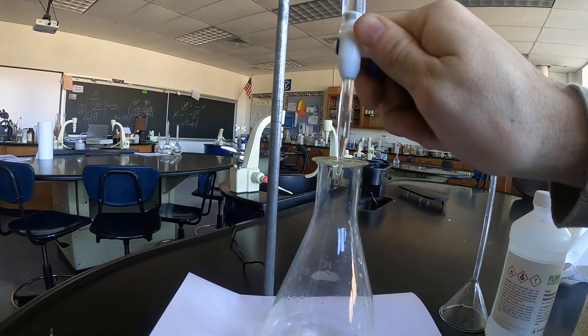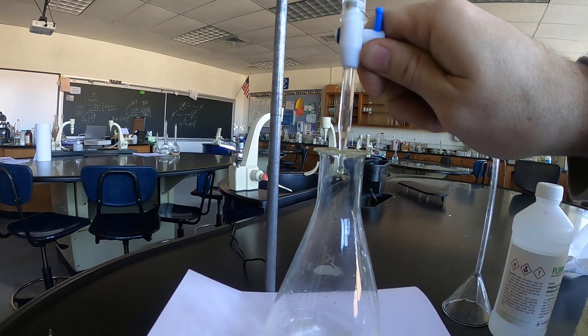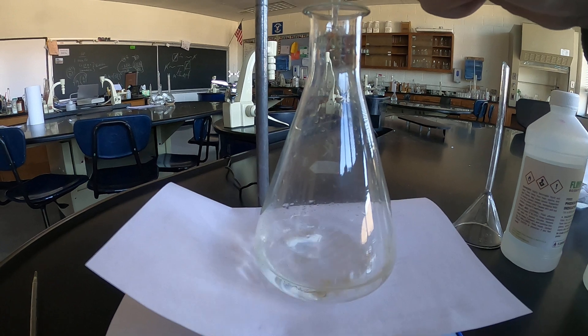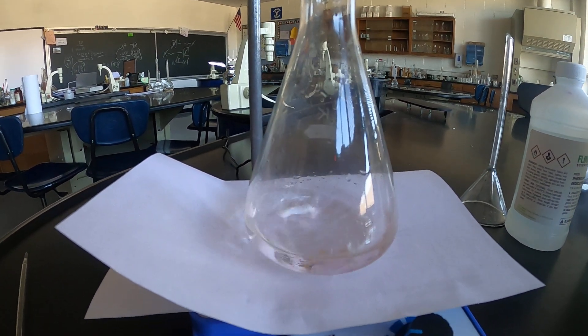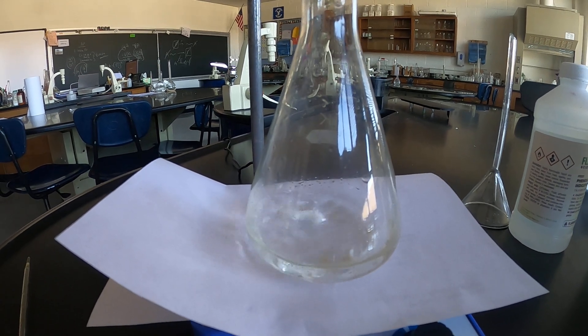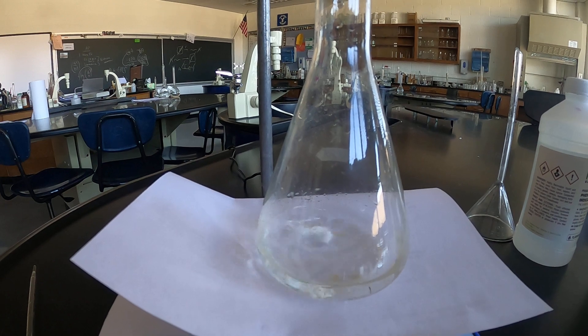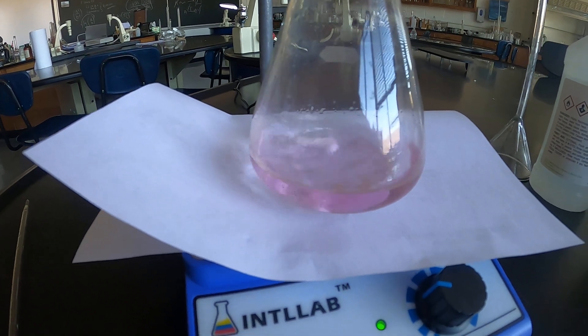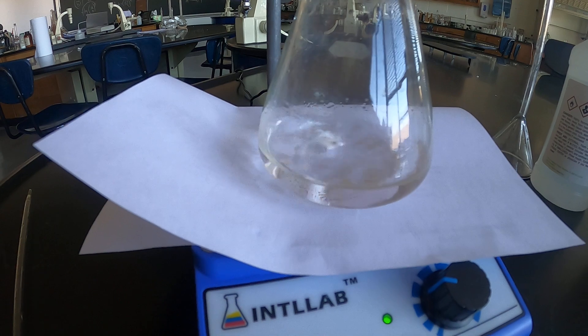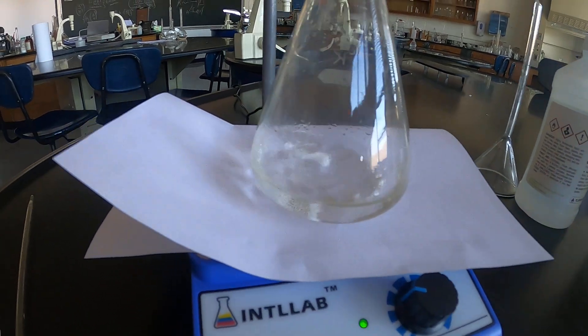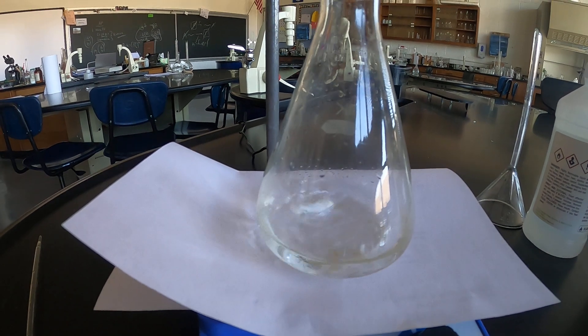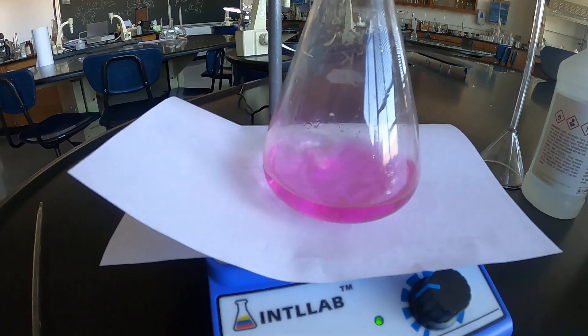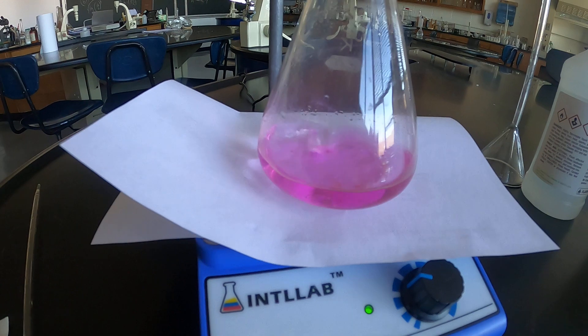I'm adjusting my stopcock to let out essentially one drop very slowly. Very close to the endpoint there. And then let out one more drop. Very close. pH is very close to seven at this point. And we're going to wait for this pink color to withstand for about 30 seconds. Phenolphthalein changes very sharply at the endpoint. Essentially one more drop. Again we're looking for a pink color that persists for essentially more than 30 seconds.